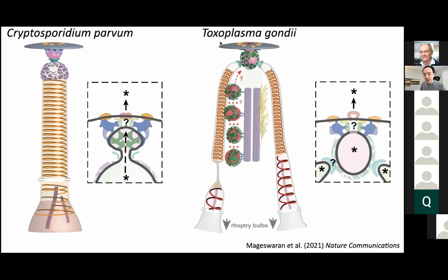So far we did not see a clear difference, because we have tried to separate the tomograms into conoid protruded and retracted sets, and then generate a subtomogram average of that part separately and compare their structures. At our nanometer resolution, we did not see a clear difference. So far, we don't think at this resolution there is some specific activity related to conoid protrusion. But there might be some more subtle differences. Actually, it might be related. We don't know. Okay, thank you, David.